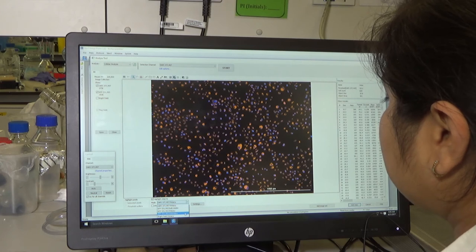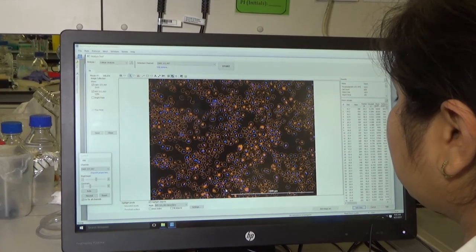From this we can draw a secondary mask and we can use this to determine the amount of nanoparticles inside the cells.